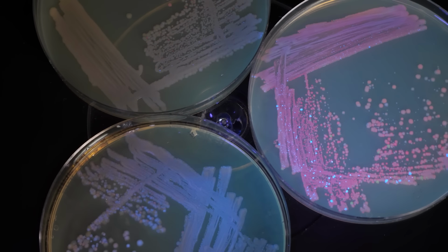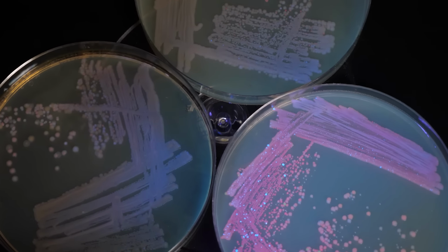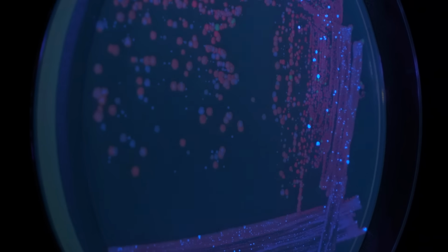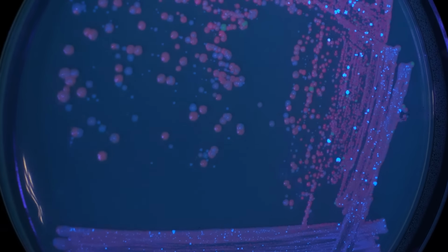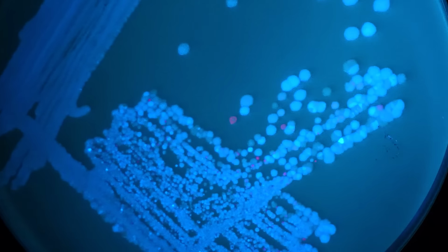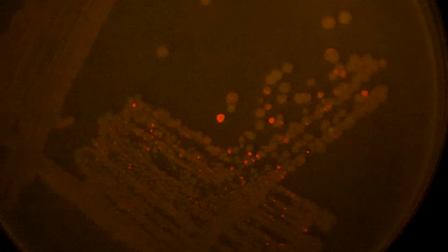Even though I can't make a time-lapse of this yet, we can still test the rest of the circuit by streaking this out onto either lactose or TET plates like the bistable switch. And sure enough, it has a huge effect. On lactose, you get mostly red colonies with blue and yellow mixed in. And on TET, you get mostly blue with red and green mixed in. Under the microscope, we see the same.